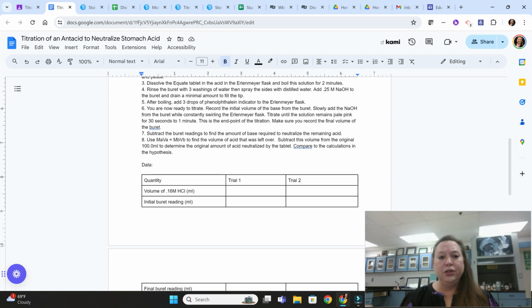What we'll do is we'll use the MAVA = MBVB equivalence point formula to determine the concentration of the acid and determine the volume of the acid that was titrated. I will make another video that walks you through those calculations.